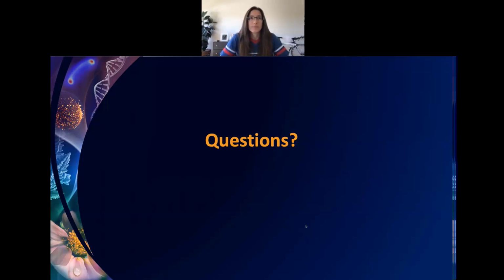So this was a ton of information, guys, and I'm super impressed with how well you guys have been keeping up with the material, and that's really obvious through all the thoughtful questions you guys have asked throughout this lecture and also this first notebook. So any final questions about the RNA-seq pipeline?